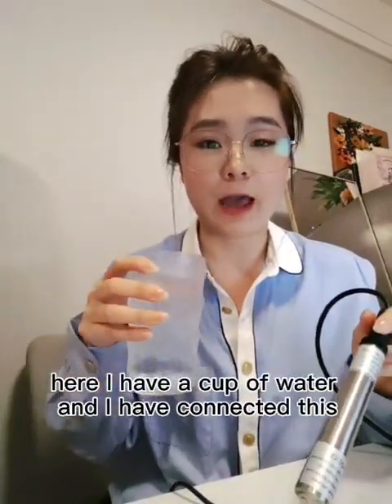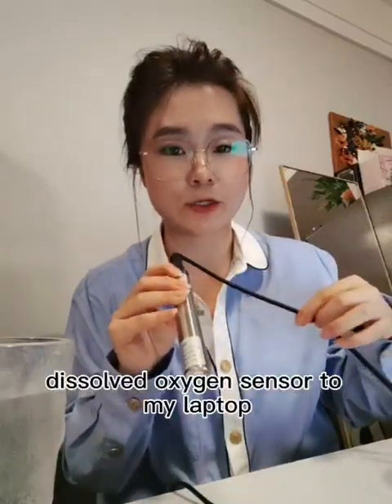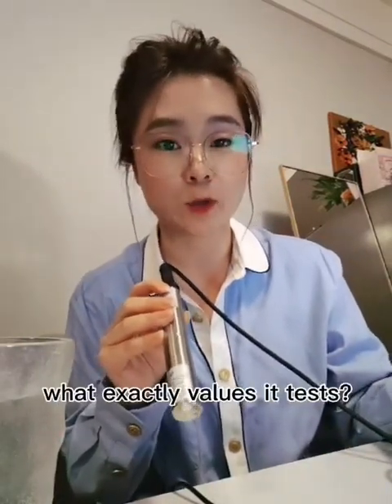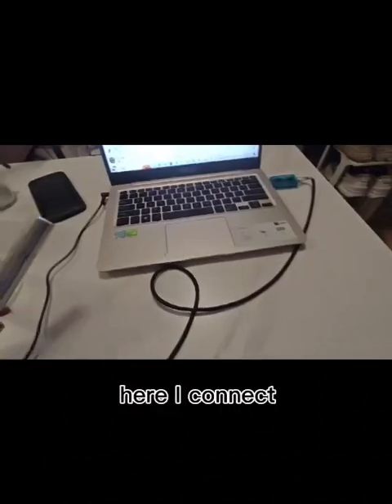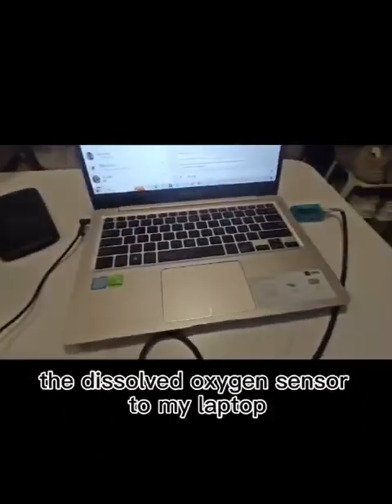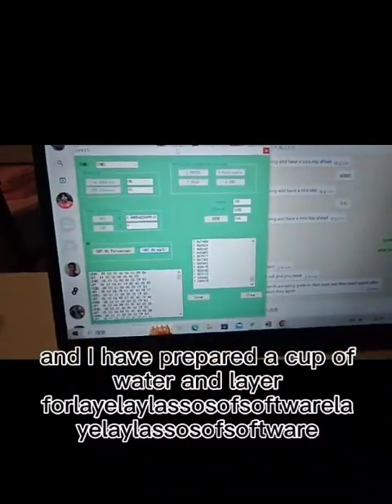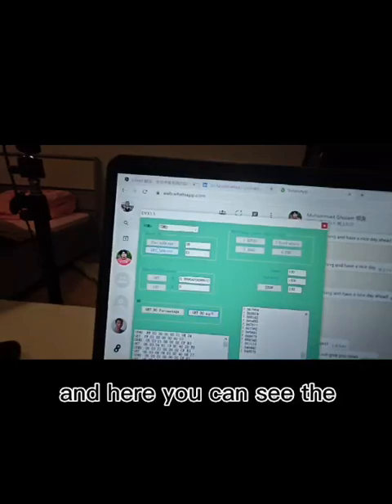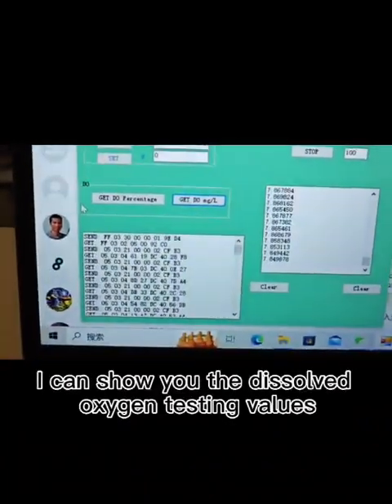Here I have a cup of water and I have connected this dissolved oxygen sensor to my laptop. I will show how it works and what values it reads. As you can see, I've connected the dissolved oxygen sensor to my laptop and prepared a cup of water to help us see the dissolved oxygen testing values. Here you can see the sensor's address — now it's 05.